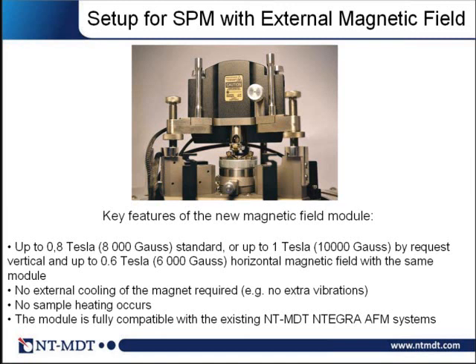So usually it is a rather big challenge to create a strong magnetic field, both out of plane and in plane, and the difficulties are obvious since, just because of geometry, you cannot create a standard magnetic system with two poles with a small spacer between them, because you need the upper hemisphere of your device for the MFM head.